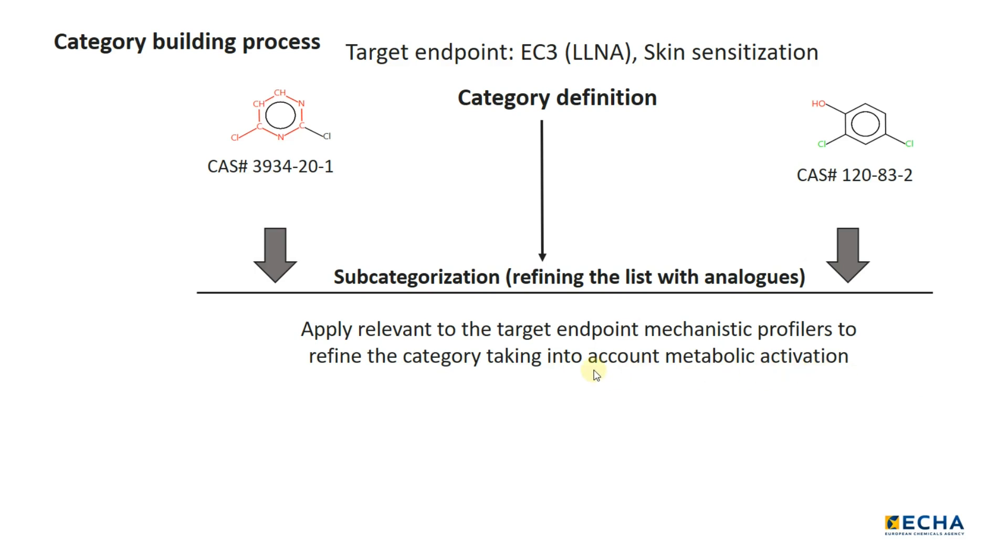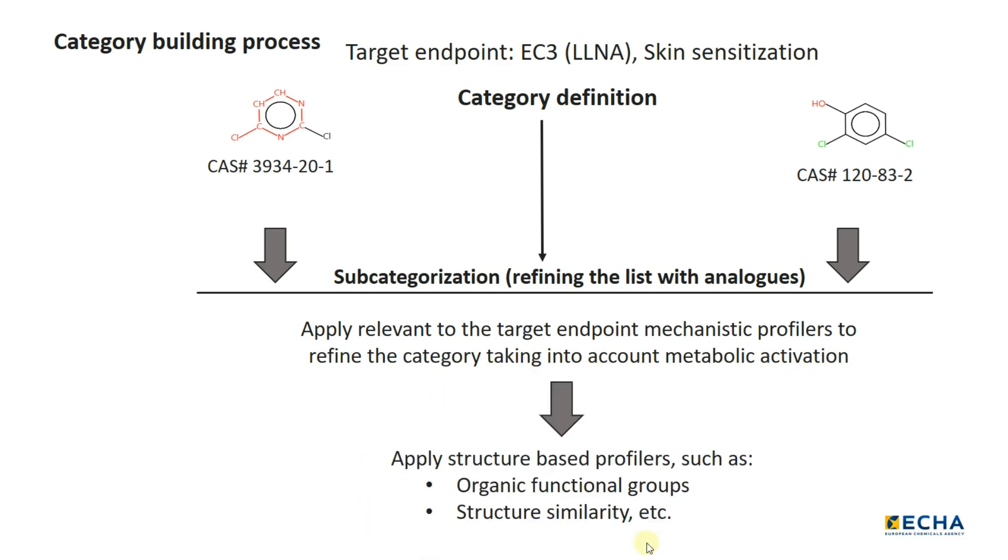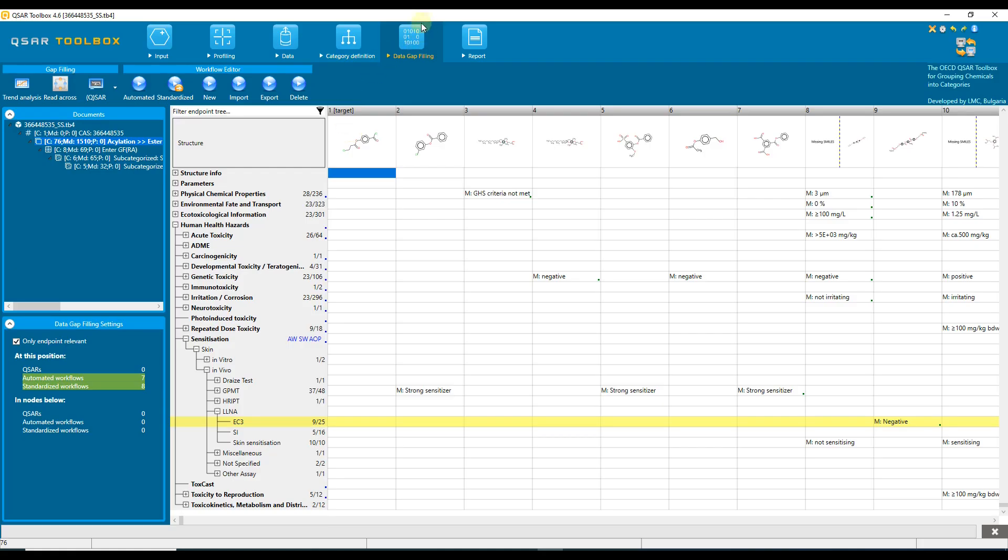In a final step, one could apply structure-based profilers to refine the list with the remaining analogs. Now let us go to the toolbox, where we will use the target chemical from the alert performance tutorial and predict the EC3 value for this chemical.